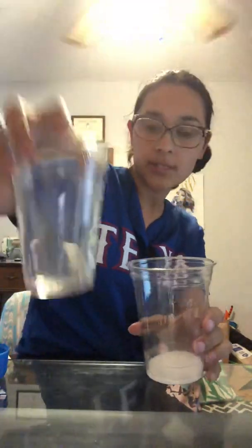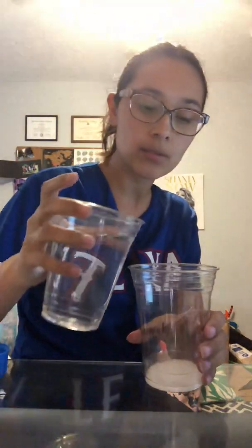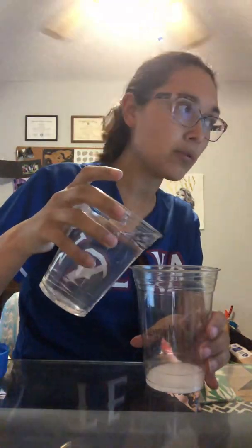So this one is also white. This one looks more like sugar crystals. White sugar crystals, that's what I would say. Okay, so we're going to mix this with water. So now we're on the second box next to magnesium sulfate.